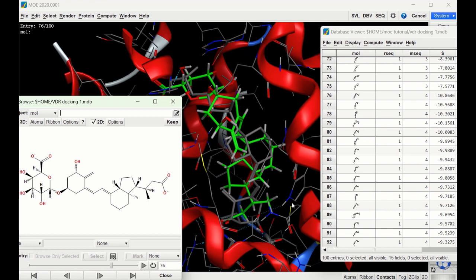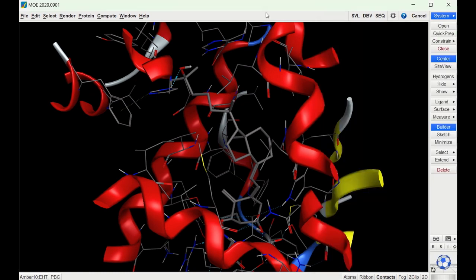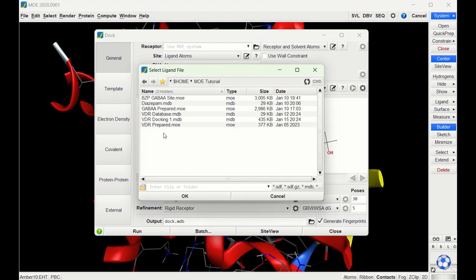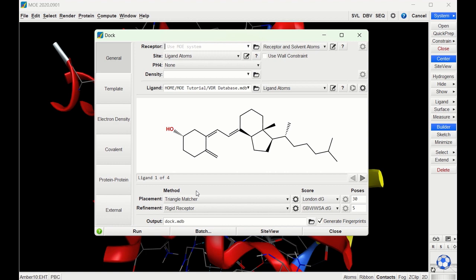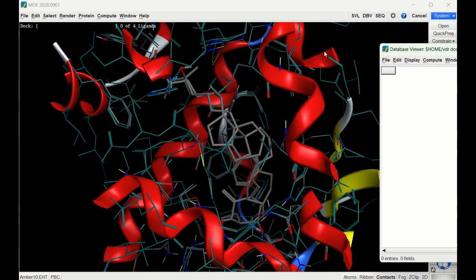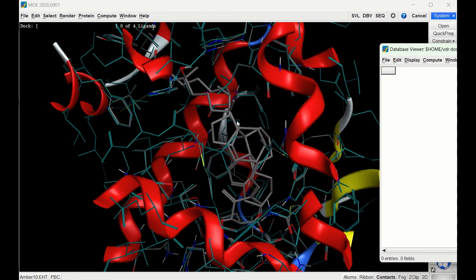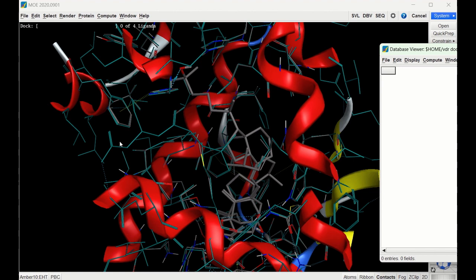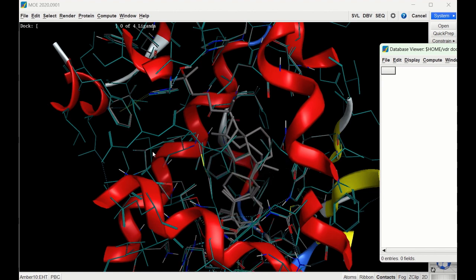Let's now try the docking again with the induced fit model. We'll close the browsing window, go back to Compute and Dock, put in the ligand database, keep Triangle Matcher, change poses to 50, switch from rigid receptor to induced fit with 25 poses, name the file, and hit Run. We can see the ligands being thrown into the receptor and, notably, some of the amino acids changing and conforming as the receptor moves.